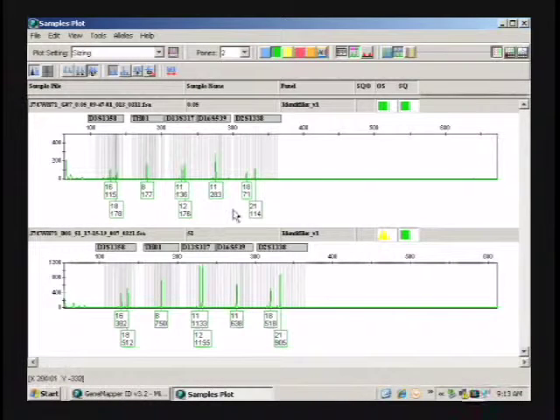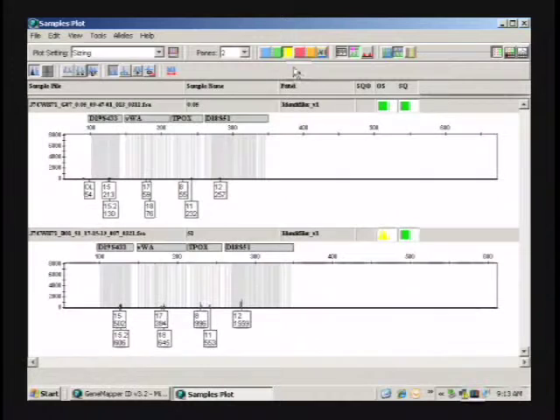But once again, this is where I think is the easiest way to implement MinElute quicker. This is obviously before you go into the interpretation of if you have nothing and you get something, and how you are going to deal with that. But as a way to easily confirm that you're not producing DNA out of thin air, that this is actually the profile that you expected to have. It's just that you couldn't use it before.